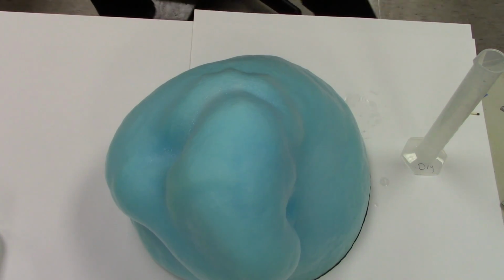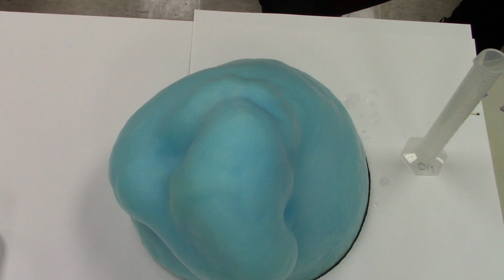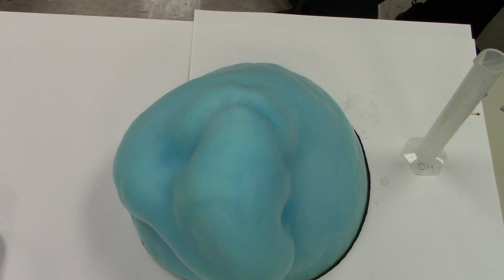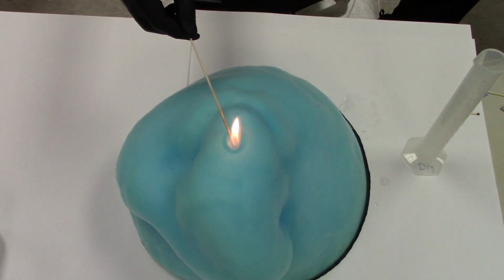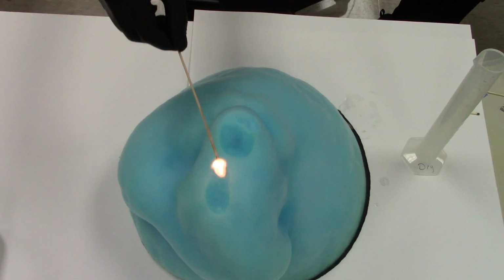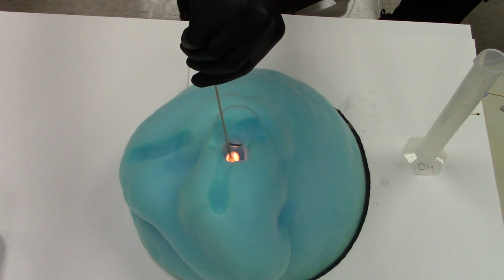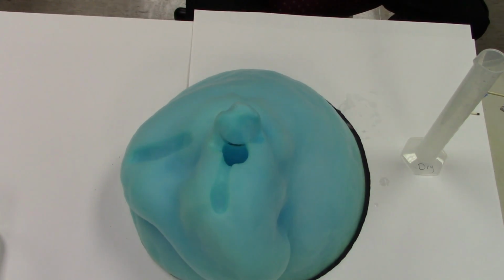Oh, shoot, the fan blew up my flame. What's inside the bubbles? Oxygen gas, right? So we can test the oxygen by seeing if it burns. Which it ought to. So this is just a swab with alcohol. So even though these are soap bubbles, they're filled with oxygen, so they burn, right? Nope, I put it in too deep and it extinguished itself, but whatever.